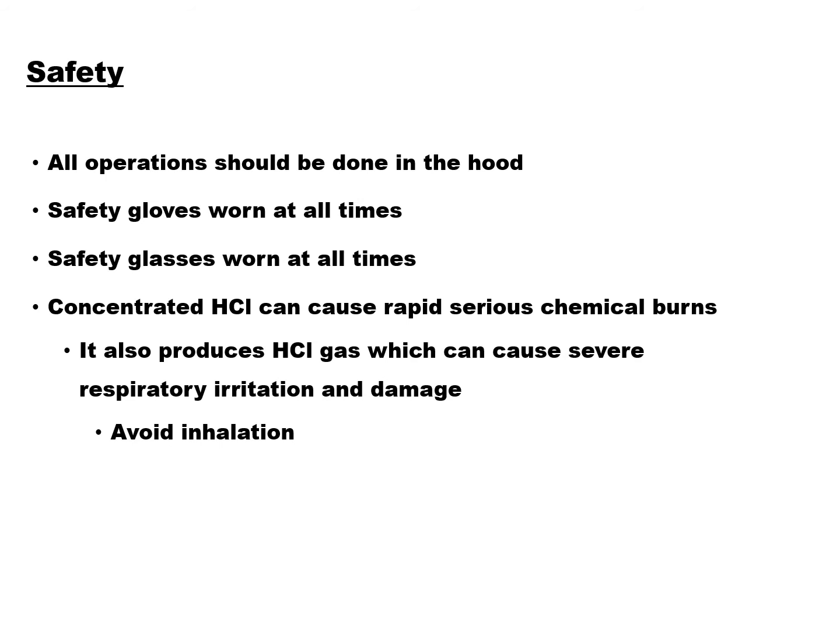So the best way to minimize inhalation is to do the entire experiment in the fume hood. And as usual, you're expected to wear safety gloves and safety goggles.